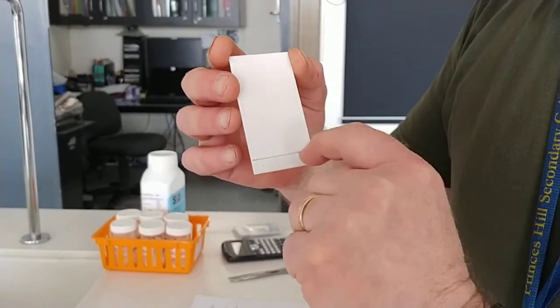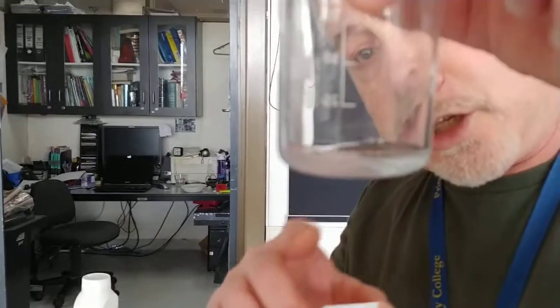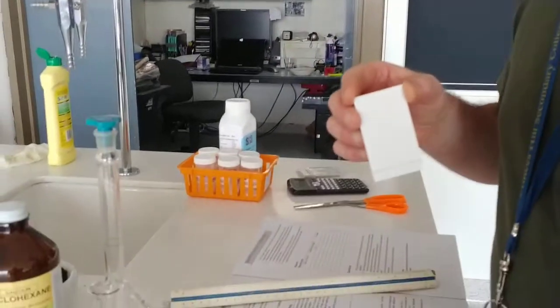And we've got to make sure that that line is above the solution that we're going to use. That's the solution, the 1-to-1 mixture of cyclohexane and the acetone. That's going to be our transport solution. That line has to be above it.